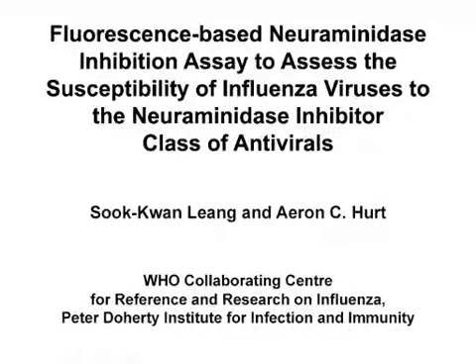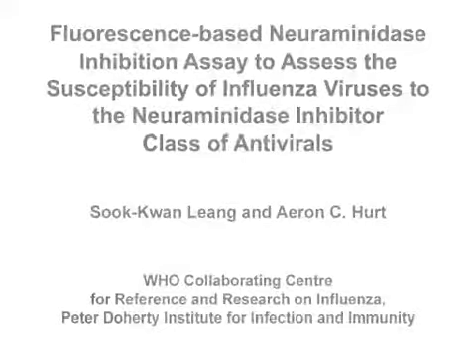The overall goal of this methodology is to assess the susceptibility of influenza A and B viruses to the neuraminidase inhibitors by using a fluorescence-based assay. This method can help determine whether an influenza virus is resistant or sensitive to the neuraminidase inhibitor class of antivirals.